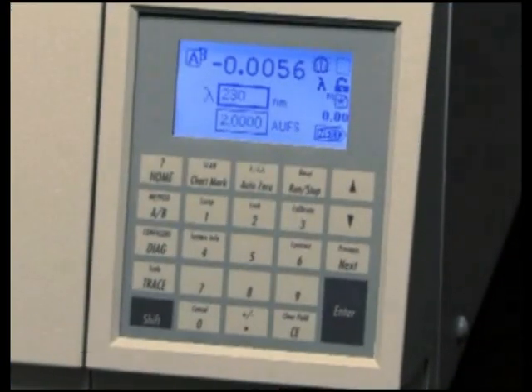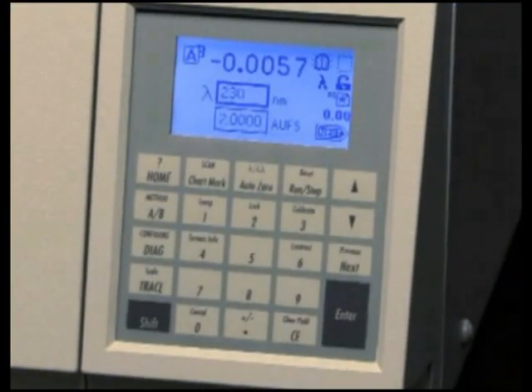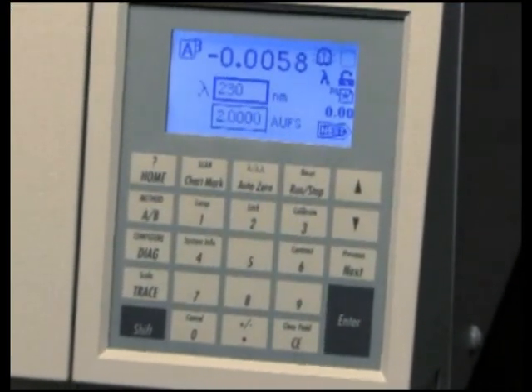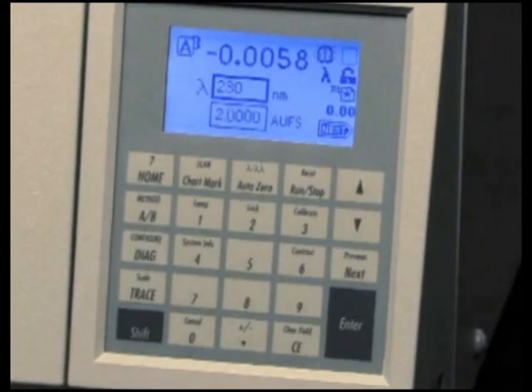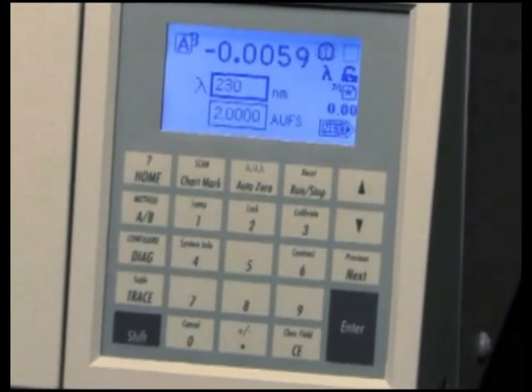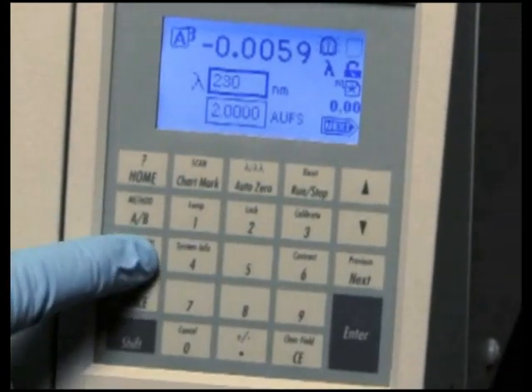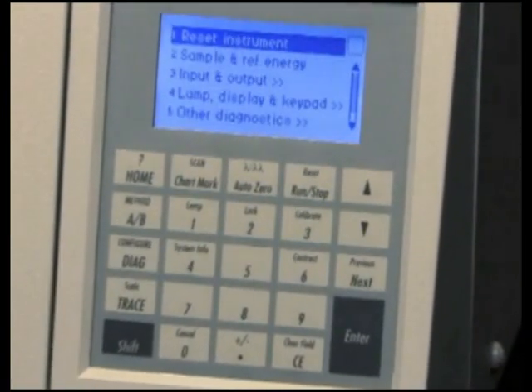The 2489 has a variety of diagnostics available to the user. To access user diagnostics, simply press the Diagnostics key.